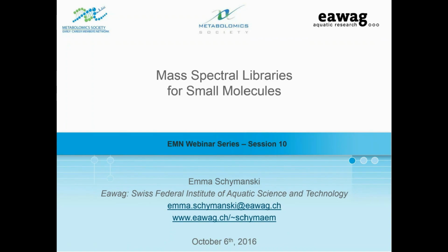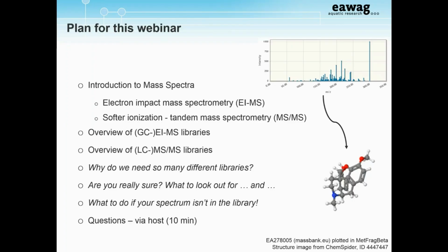He's already said where I come from, so with that I will go straight into my plan for this webinar today. Because I understand this is going to be a resource for early career members as well, this will start pretty much with an introduction to mass spectra to make sure we're all on the same page.